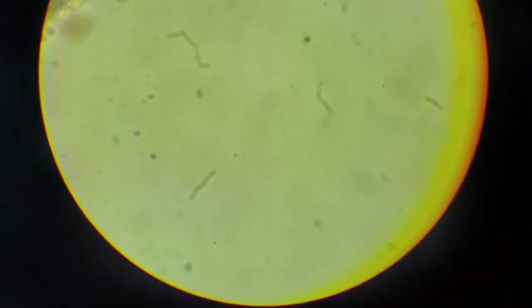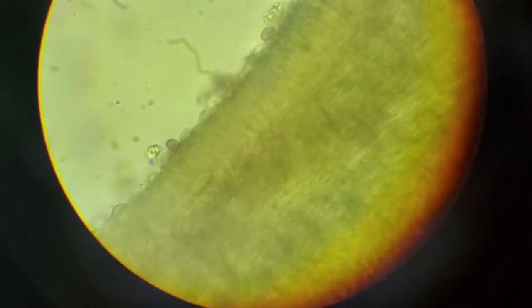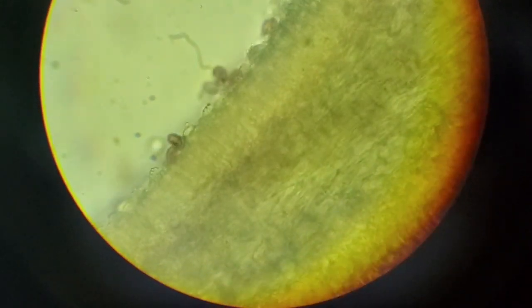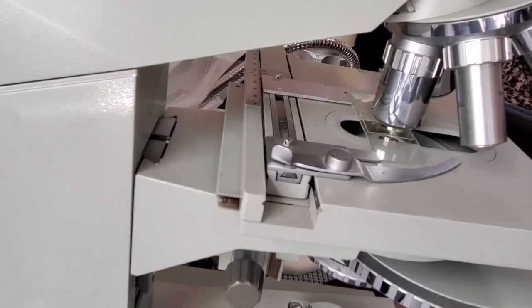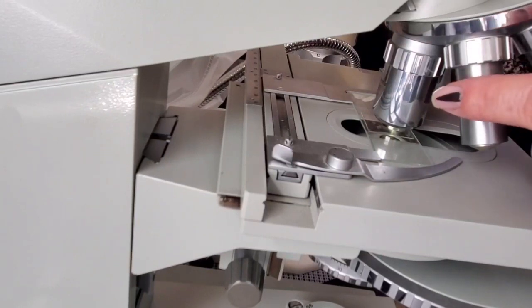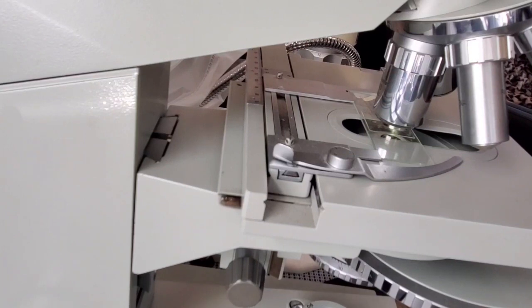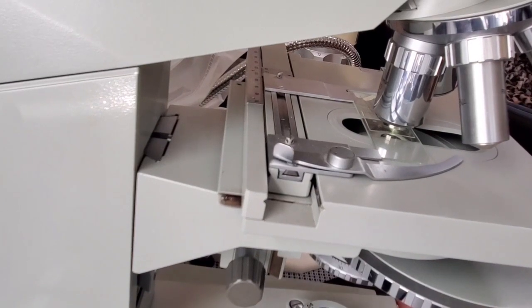You want to get sections that are very, very thin so that you can see these properties and you can measure different structures. But in order to measure, the best way to do that is to go into oil immersion. So let's look at it with oil immersion. When you're getting ready for oil immersion, you're usually already on the second to highest objective. This would be your high-powered dry objective if you have all of these. And the last thing you're going to do is go into oil.